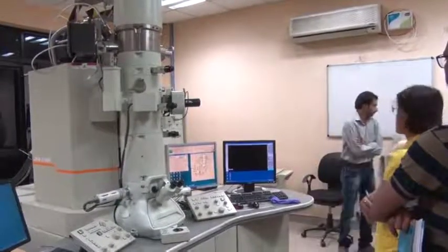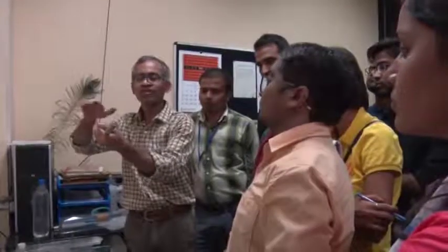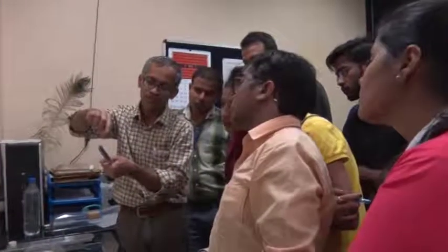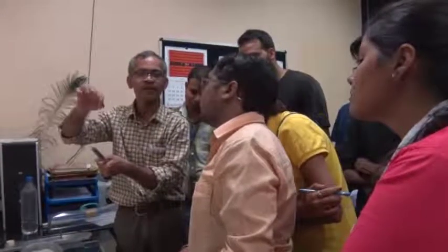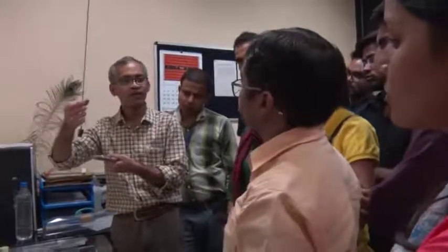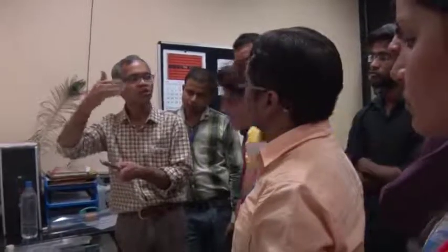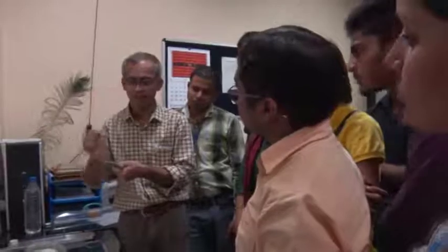Since it is still light, and this is a single tilt holder, which means it will only rotate in this manner. Yeah? So this is called alpha tilt or X tilt, and the sample itself is actually sitting here. At this front part you will see this kind of structure, which is 3 millimeter. A TEM grid is already inside there. On that they have mounted gold nanoparticles, and they are quite good. So we will learn about that as the next sample. For STEM we might change to this sample.